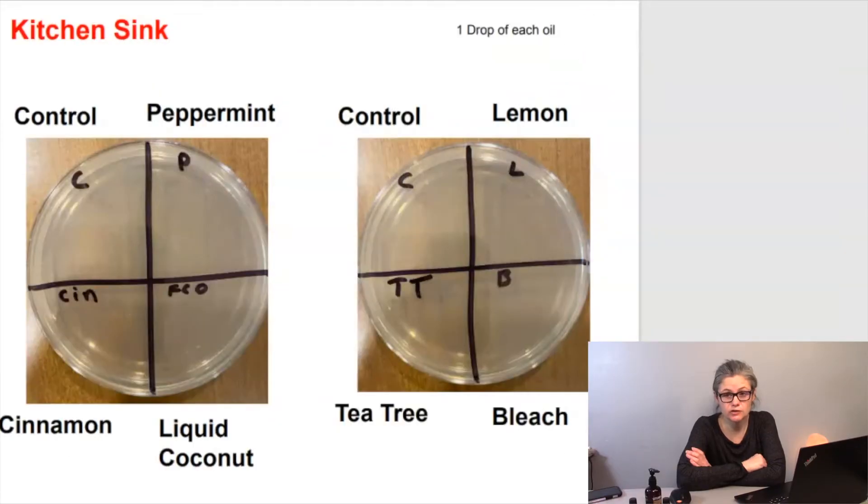So for the second test, I just used the kitchen sink for the bacteria because I'm pretty certain that my kitchen sink has lots of bacteria in it. This time, I divided the petri dishes up into four sections instead of six to give each area more space.